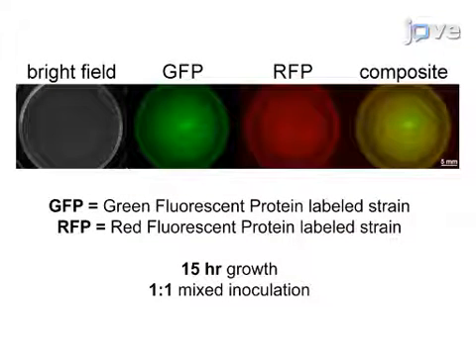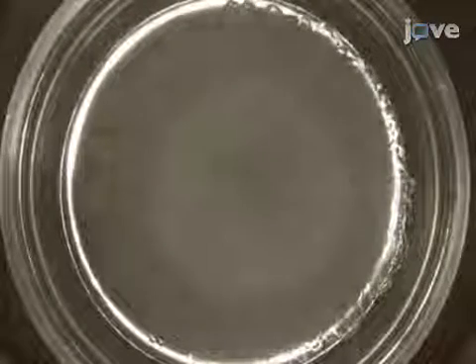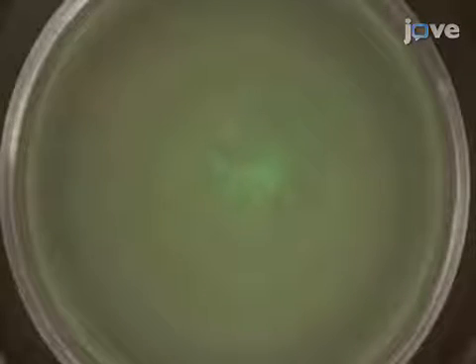This figure shows the growth of a typical two-strain co-inoculated Bacillus subtilis colony. Swarming, which is a flagellum-dependent collective surface movement, results in a highly mixed population. In this time-lapse video, the initial inoculant was placed in the center of the plate spread. Thin layer swarming is clearly observed, and as the colony develops, the two red and green fluorescent strains appear mixed and overlapping.